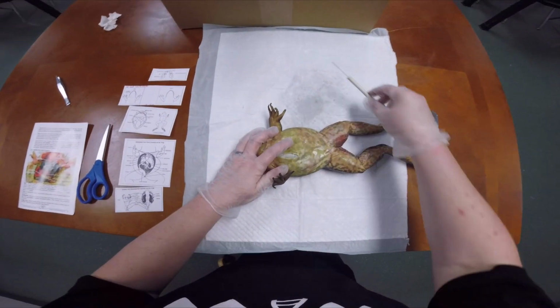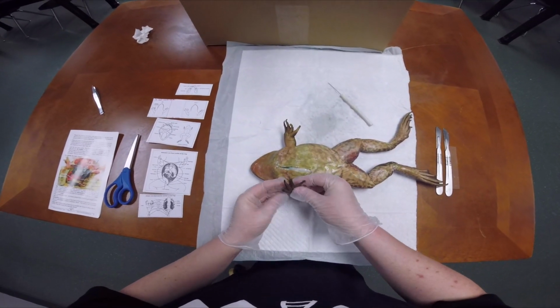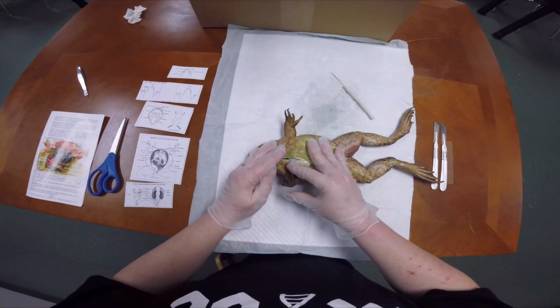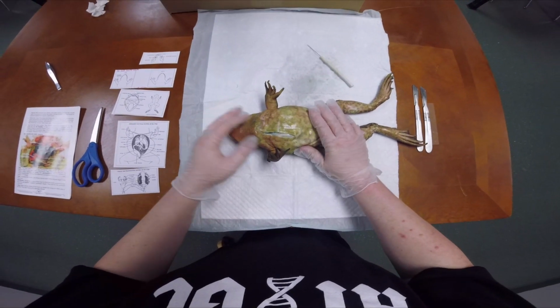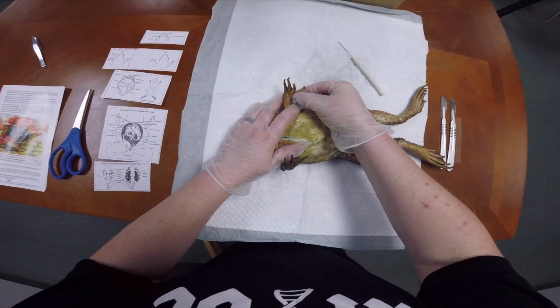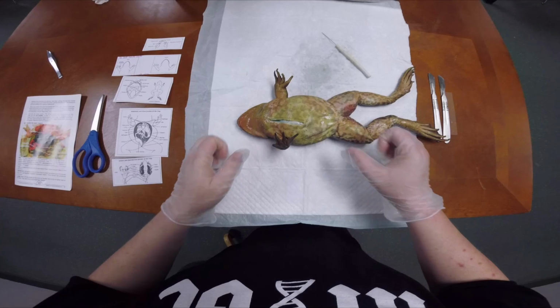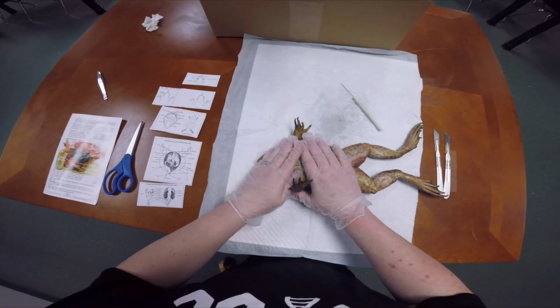So now we're going to see if we can tell whether this specimen is a male or a female. Males will have a very large pad right here on their thumb. This one doesn't. So before we open up, I'm going to assume this specimen is a female, just because you can see there's 1, 2, 3, 4 digits. This one would have a very large thumb pad if it was a male for breeding purposes, and I just don't see that on this specimen. So my hypothesis is that this specimen is female.